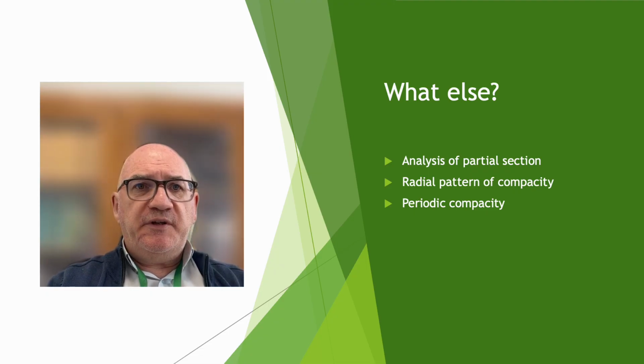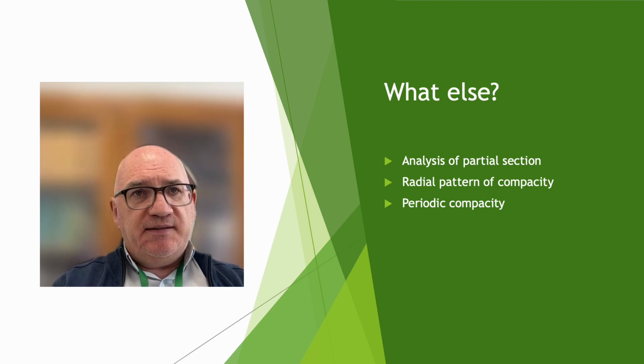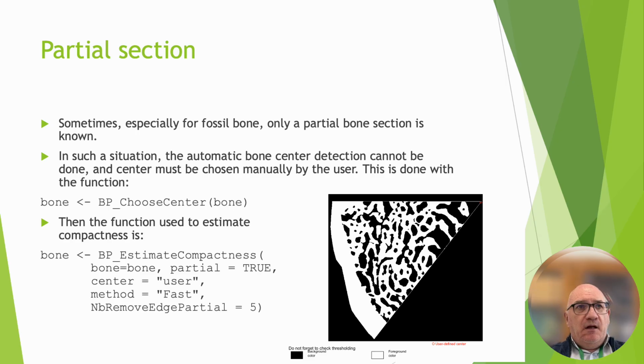In the previous video, we saw the basics of BoneProfileR methods, and now we will analyze partial section and see how we can model the radial pattern of compacity or periodic pattern. Sometimes, especially for fossil bones, only a partial bone section is known.